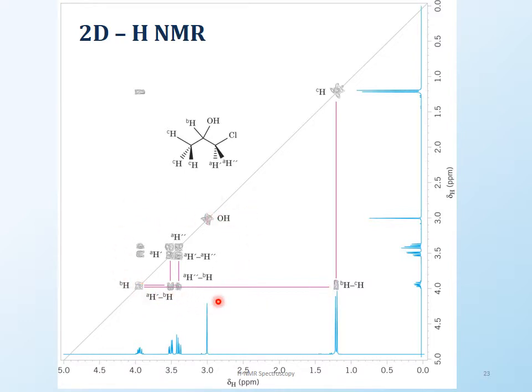It's almost like flying over a mountain range. When you fly over a mountain range, you get a better perspective of where everything is, rather than looking at it from the ground where you see only one dimension. If you look at it from the top, then you see a better perspective. This is exactly what we see in a 2D NMR. It's really fun when you start having complex molecules, then you get to run 2D NMRs.